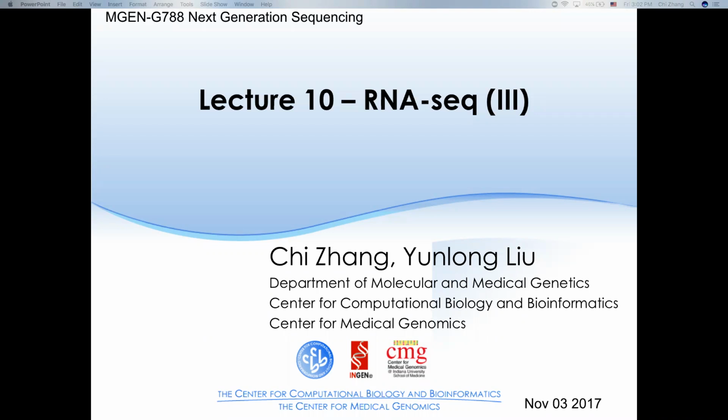So all right, let's start. So today will be our last lecture about the RNA-Seq data and RNA-Seq data analysis. So basically today I will summarize the key points and the key knowledge points and take-home messages we have in the past 2 lectures. And also we will introduce some advanced topics in RNA-Seq data analysis. And also we will do the hands-on part later. And then, if we have enough time, I will do some introduction about single-cell RNA-Seq data study.